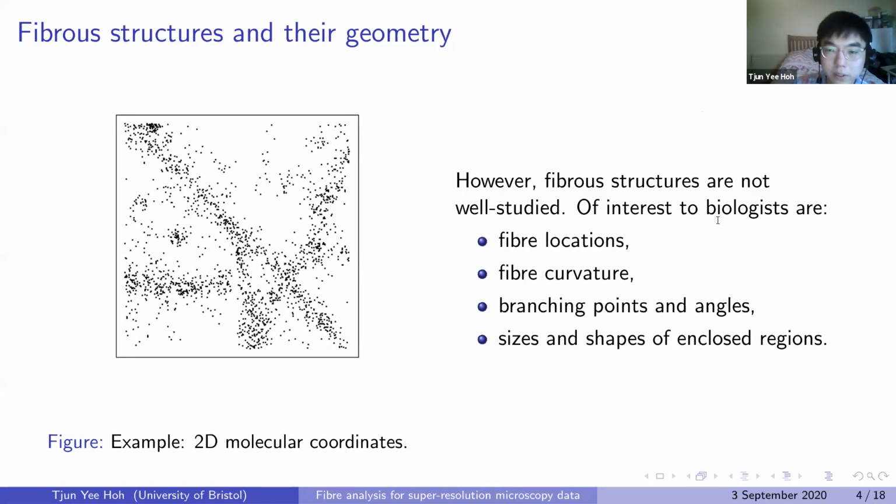So interesting features in the structures may consist of the locations of the fibers themselves, the curvature of the fibers, intersection points and branching angles, and also the sizes and shapes of the enclosed regions formed by this meshwork.